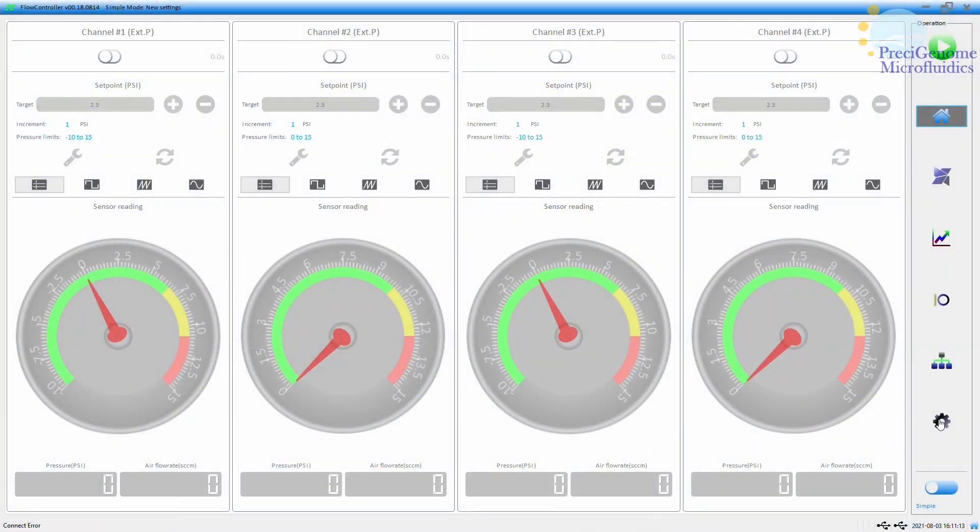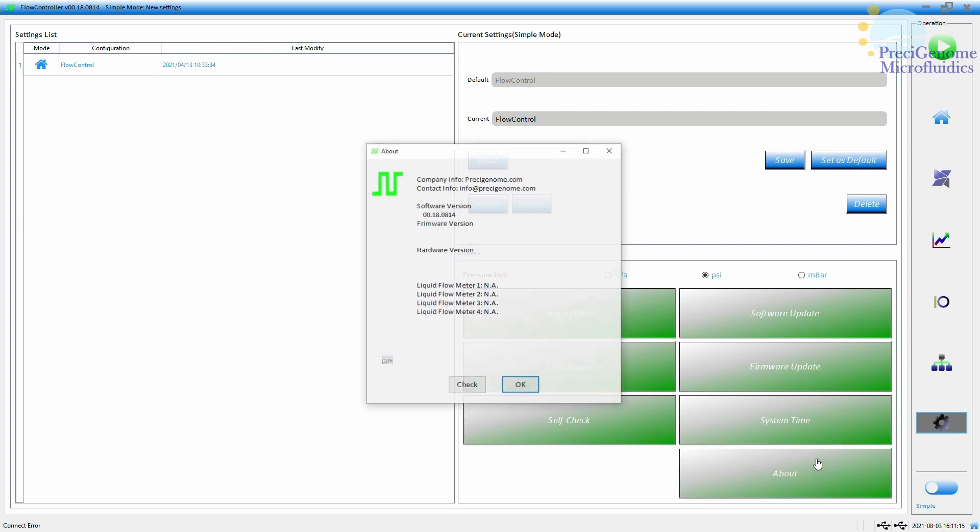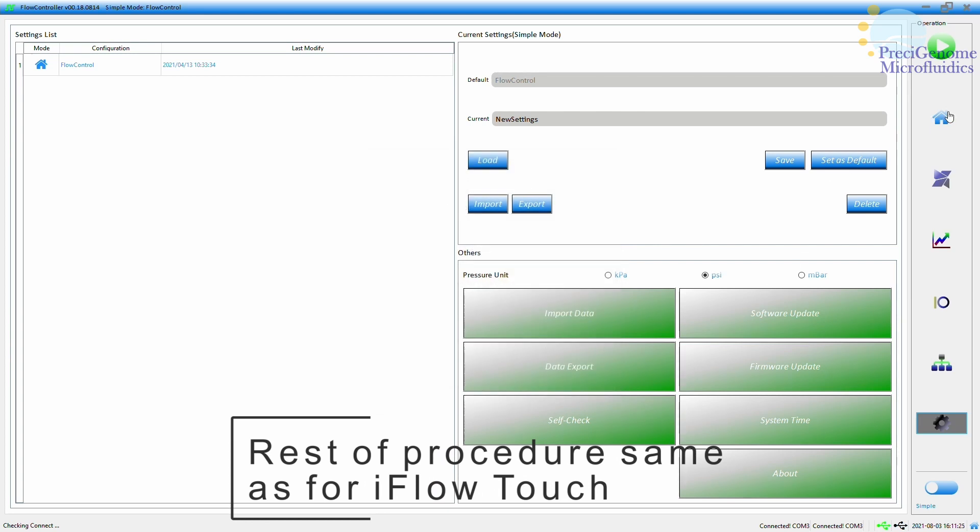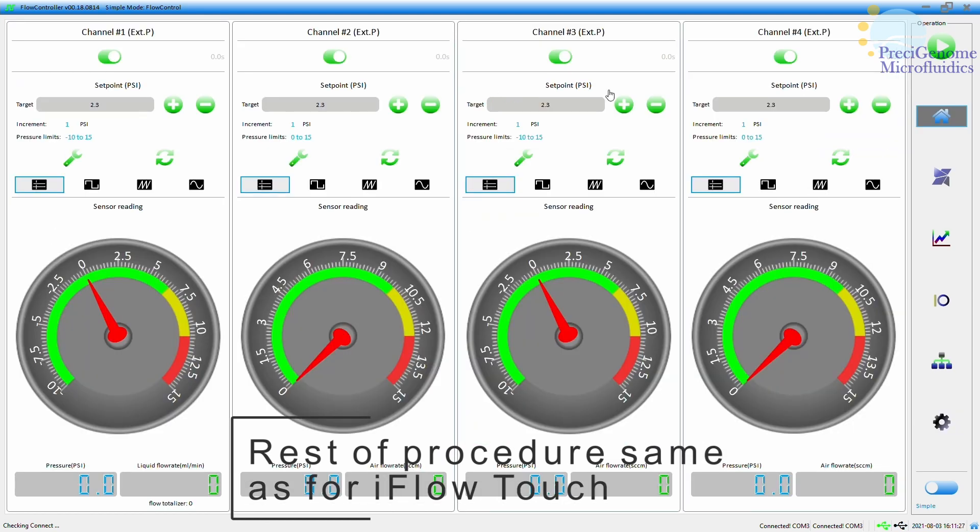In the Flow Controller app, go to Settings, About and Check. The rest of this procedure is the same as for the iFlow Touch, so please see its software tutorial.